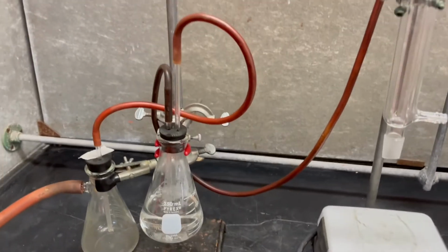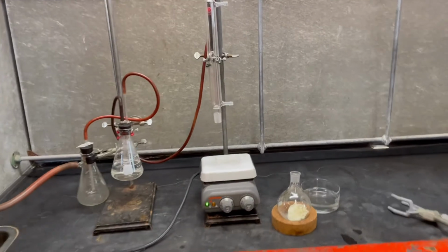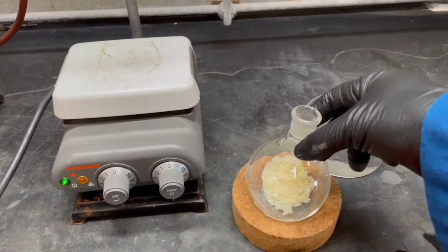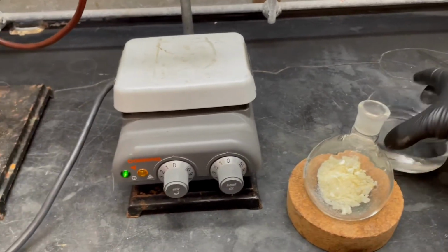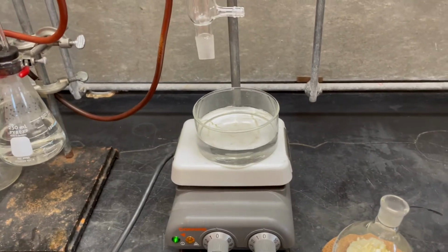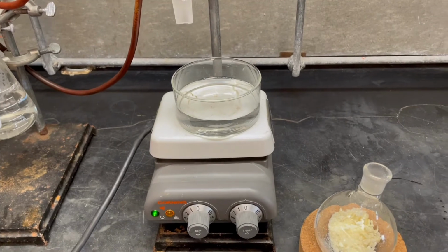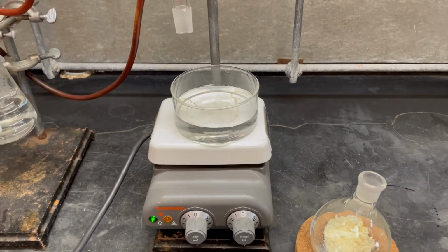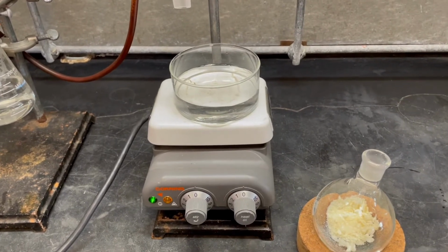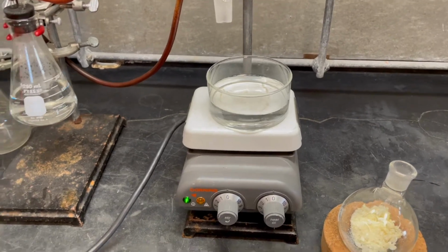All right, y'all, we're about set. Looking good. Okay, so here's my solid material, about 5 grams. We're gonna put this in a water bath. It's gonna be about 70 degrees for about an hour. If we're still evolving a good amount of nitrogen oxide gas, then we want to heat it for an additional 15 minutes and then we'll stop after that no matter what. We will heat it again at 70 degrees.